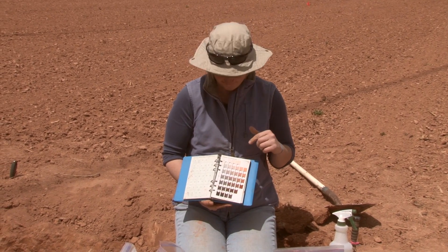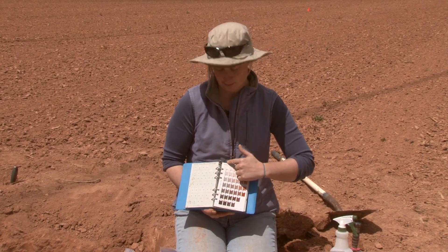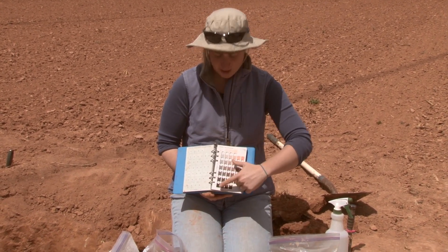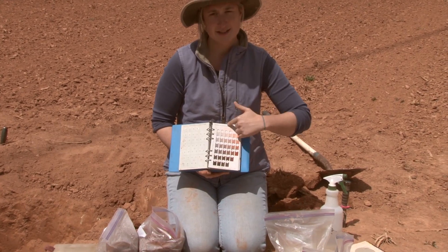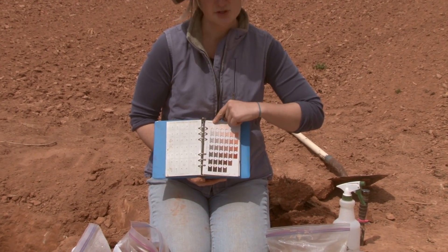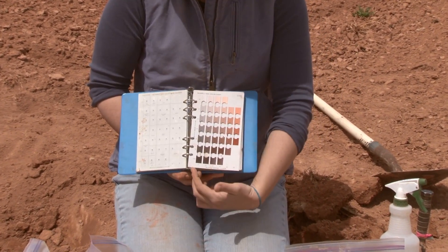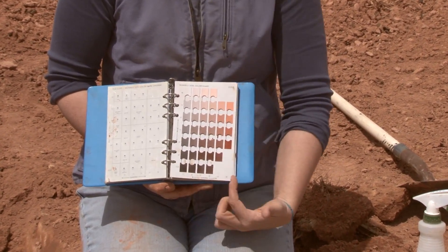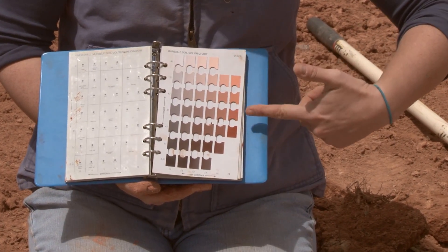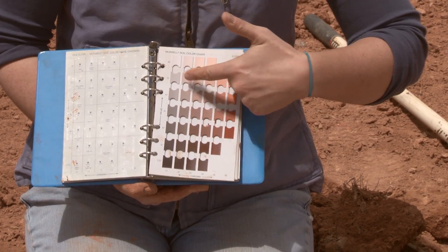The next part to identify is the value, which is the up-and-down number, and the chroma, which is across the bottom. The value is how bright or light-colored the soil is — it's darker brown at the bottom and almost pure white at the top. The chroma is how dull or how bright the sample is: the really bright oranges are on one side, and as you go toward the binding of the book they become more gray and dull.